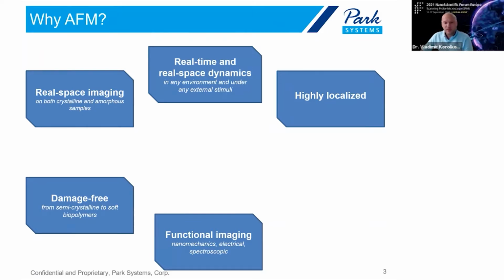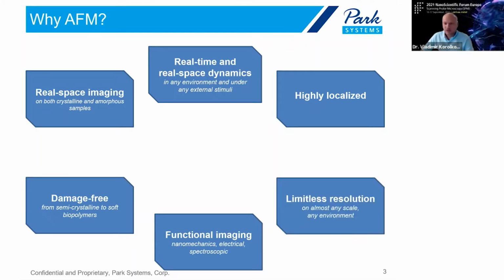You can probe nanomechanics, like in the previous talk, where you can do single force curve experiments and measure interactions between single protein molecules. You can measure electrical properties, and now spectroscopic measurements. And critically, in principle, there is no limit to resolution. It's a technique that provides really limitless resolution capabilities.